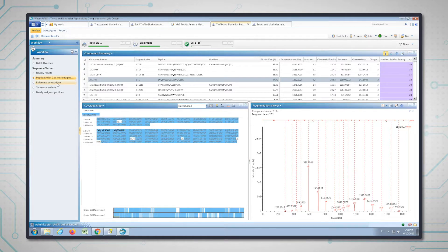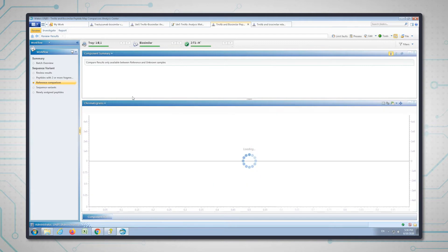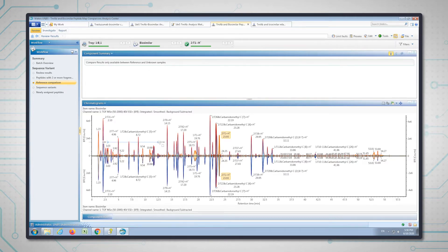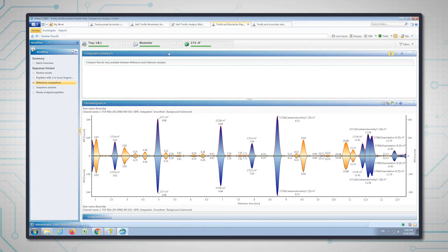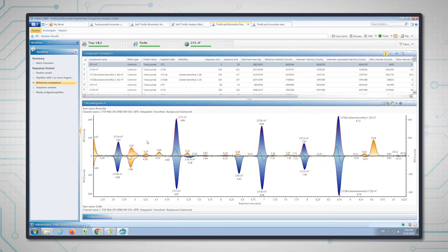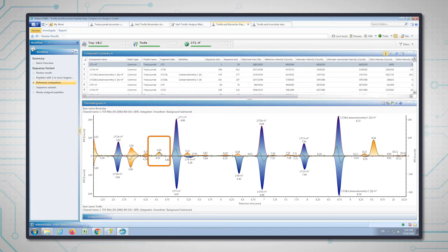In the reference comparison, we're now going to look at the chromatograms, the BPI chromatograms between the biosimilar and the innovator. I'm going to zoom in on a specific region of the chromatogram with the biosimilar as the reference, and then choose the innovator trastuzumab to do the comparison. We can see there's a peak at 9.54 minutes that's present in the biosimilar but not in the innovator. These could be two candidate peptides that we can take through for elucidation.